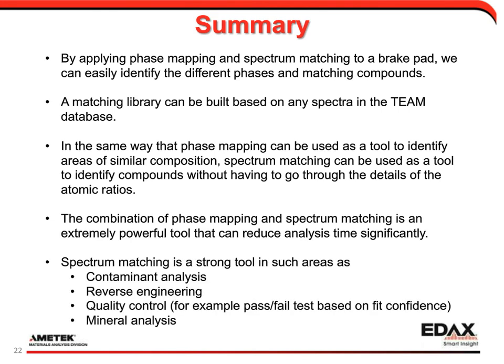We are seeing use for spectrum matching in quite a few different areas already, even though it's a fairly new feature. Some of these are contaminant analysis. If you have a process where you have the risk of contamination throughout the process, you can build a library of the potential contaminants. When you get a contaminated sample back in, you can acquire the spectrum and quite easily match it up to your known contaminants and figure out, okay, what is this, what compound is it, and thus where in the process was it most likely contaminated.